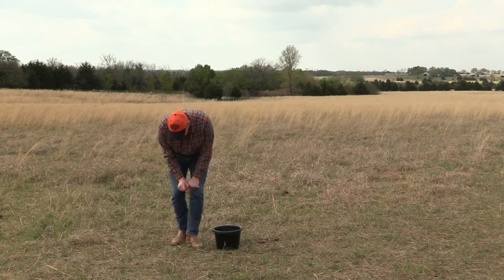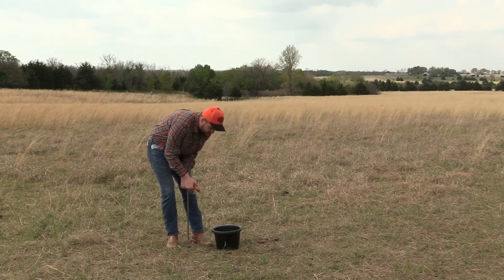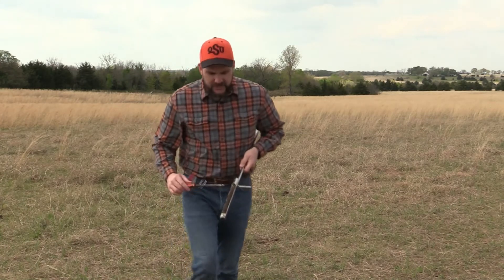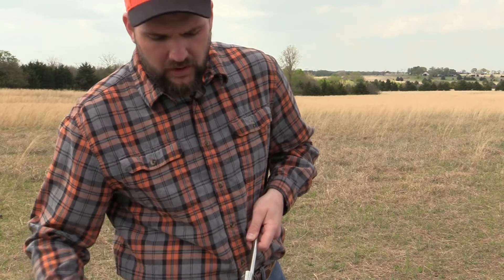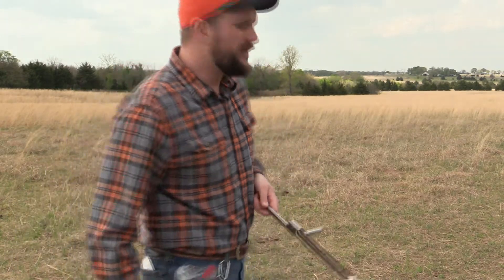What you would do is go by, push that probe down into the ground, give it a good twist, pull it back up. If I walk it up to the camera right here, we can see that we've got probably about eight to ten inches of a core. We've got a little bit of topsoil right here and we've even got a little bit of the farther-down soil.